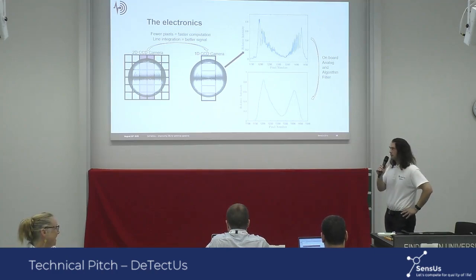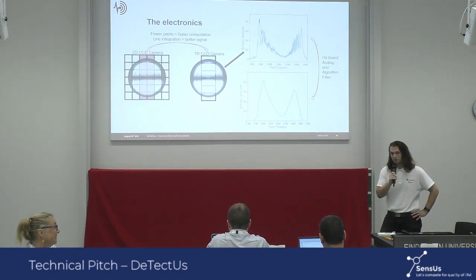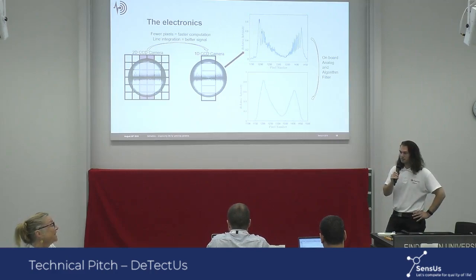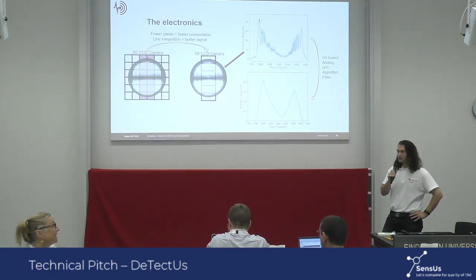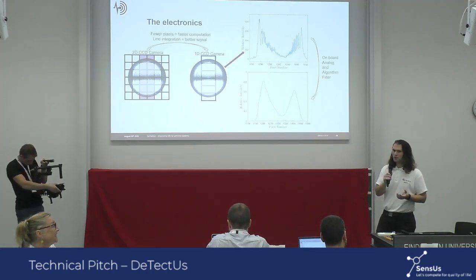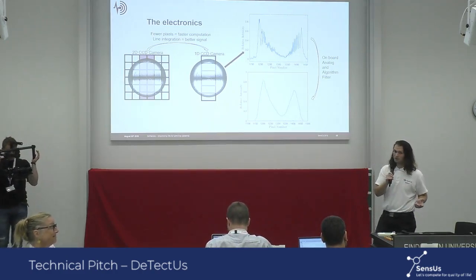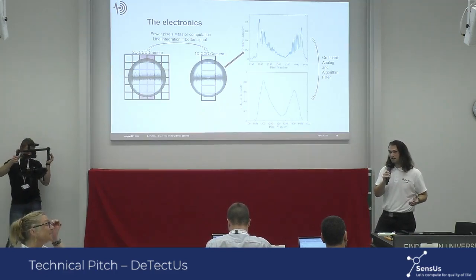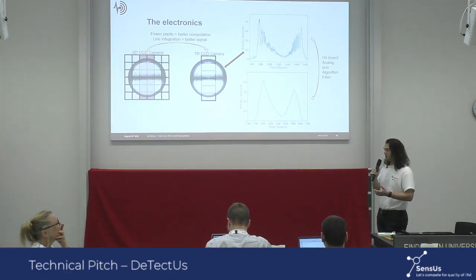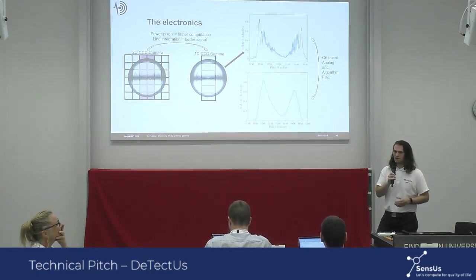I think what we actually saw, in the end, to detect the affinity of the molecule, we used a Biacore instrument in a pure buffer. And when going to plasma, it messed up our sample or the signal completely. We couldn't really do reliable measurements using the commercial one. But maybe because we're not using a dextran matrix, we saw that the plasmons, the measurements, were unresponsive to plasma over an average of chips and measurements.